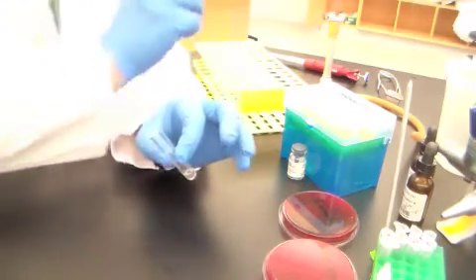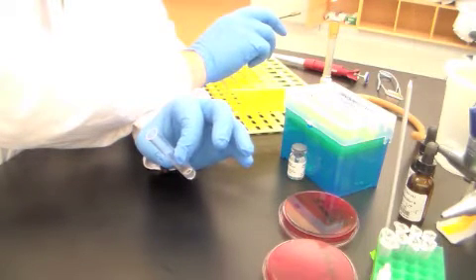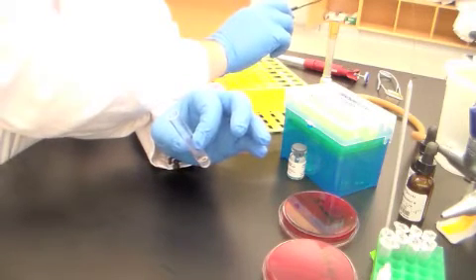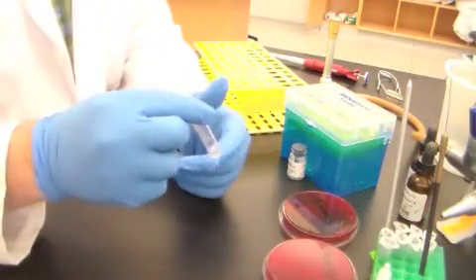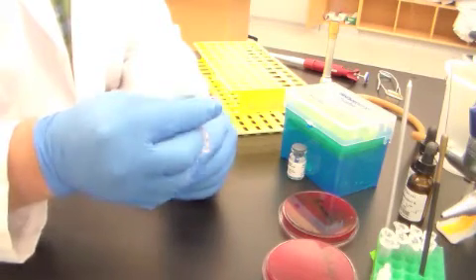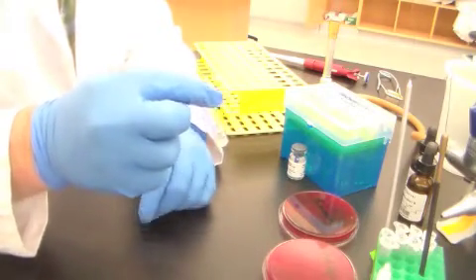I'm going to sterilize this loop before I set it down, because remember that we're dealing with a human pathogen here, and hopefully you'll identify which one of these species is most likely to be virulent based on the presence of coagulase. So I'm just going to gently mix that a little bit. And you can see a little bit more turbidity to that plasma now that the staphylococci are mixed in there.